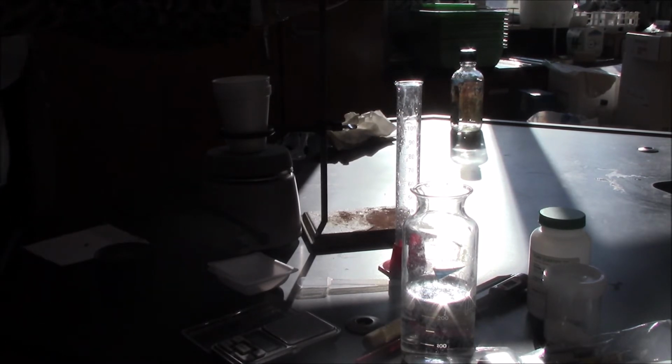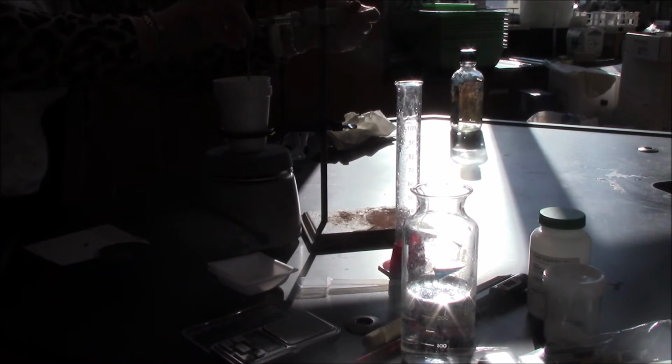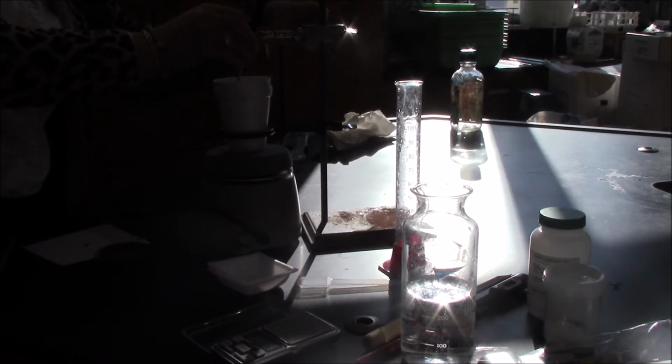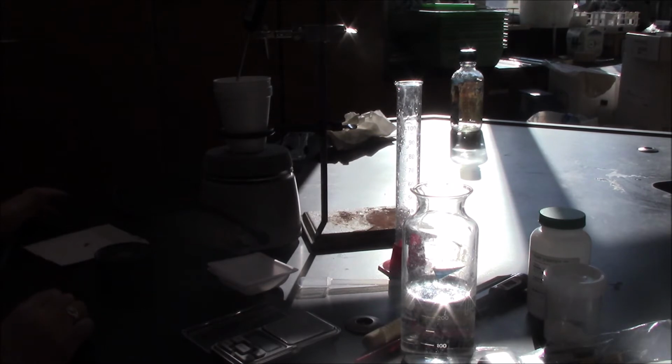I set it to stir because I want the heat to be evenly distributed in the water once the experiment gets started. All right. I also want an accurate reading for my initial temperature. So I'm going to turn on my thermometer, and I'm going to do just that. I'm looking to write down an initial temperature of my water. I see that the initial temperature of my water is 20.9 degrees Celsius. So I'm going to record that.